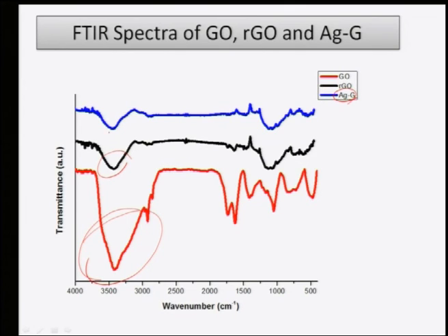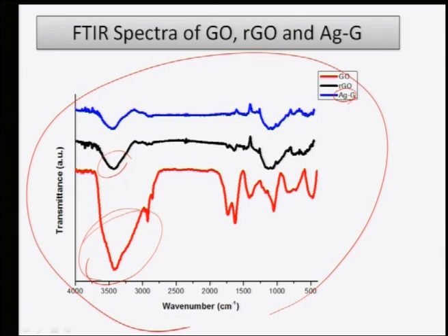So one can do this kind of analysis on solid samples very easily, and finish up. Okay, with this I complete my lecture on FTIR.